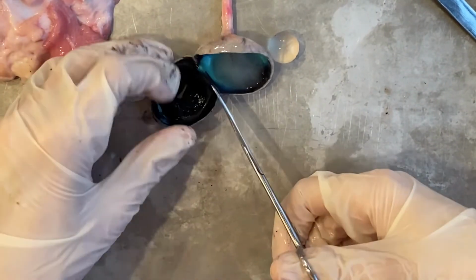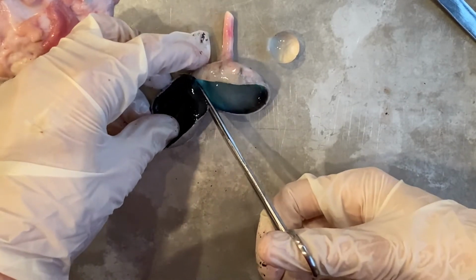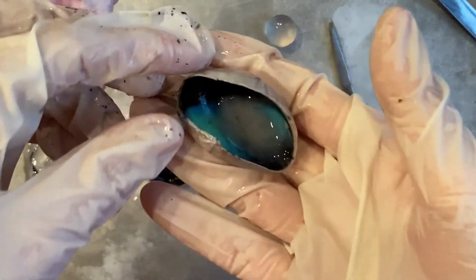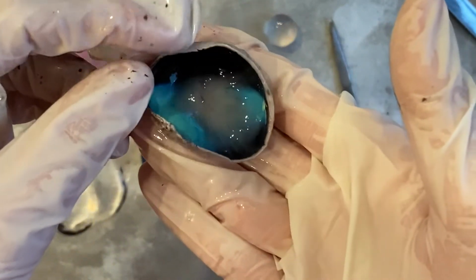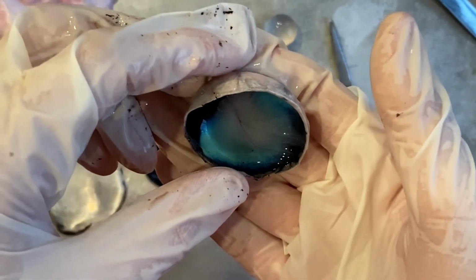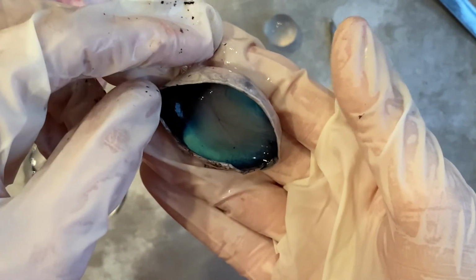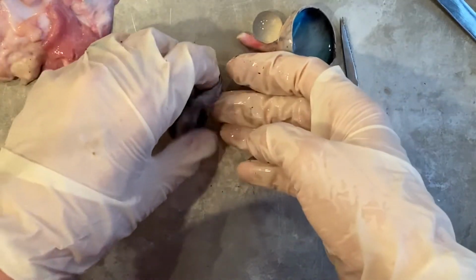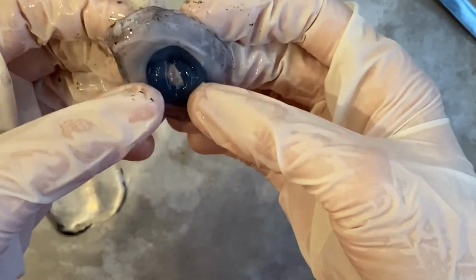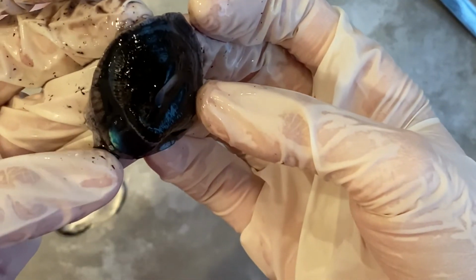Okay, so we're going to separate out the anterior and posterior portions. Okay, so here we have what I'm guessing is the retina floating around, kind of sliding in the back, and then against the back is the choroid, which is part of the vascular tunic. So this is the iris, and the hole is the pupil. And we will go ahead and try to remove the iris from the anterior portion.